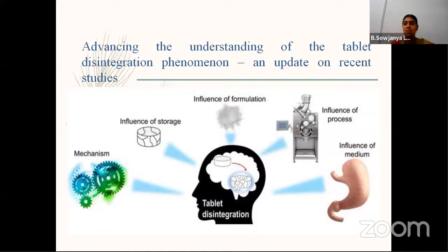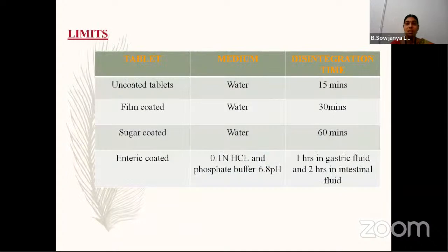Simply, disintegration is the breakdown of the tablet into smaller granules. If the hardness is increased, or the concentration of binders increases, it delays the disintegration time, and the dissolution process is also slow, the absorption is very low, and the therapeutic activity is also very low. So hardness and binder concentration play a key role in the disintegration time of a tablet.